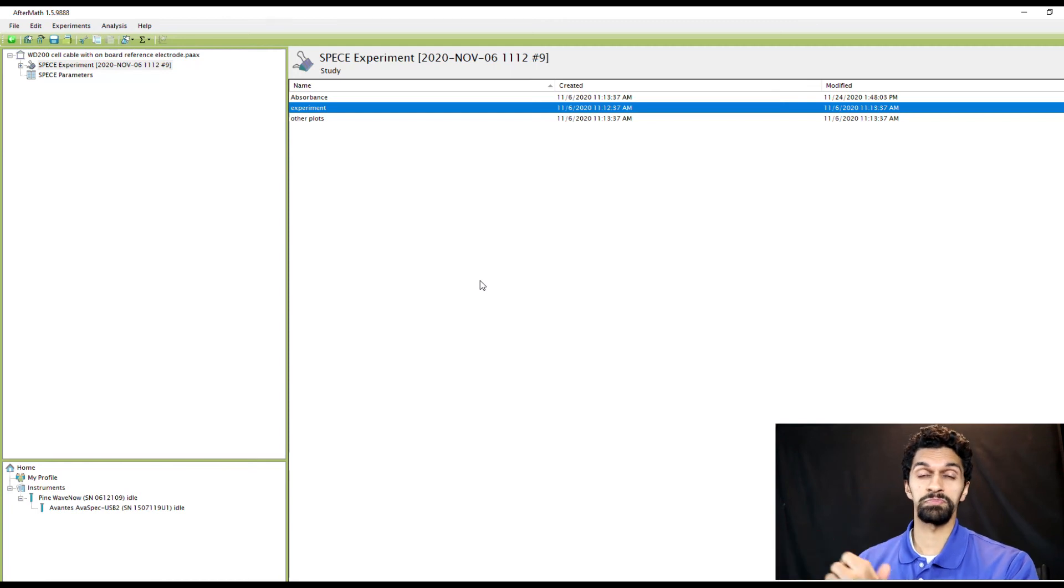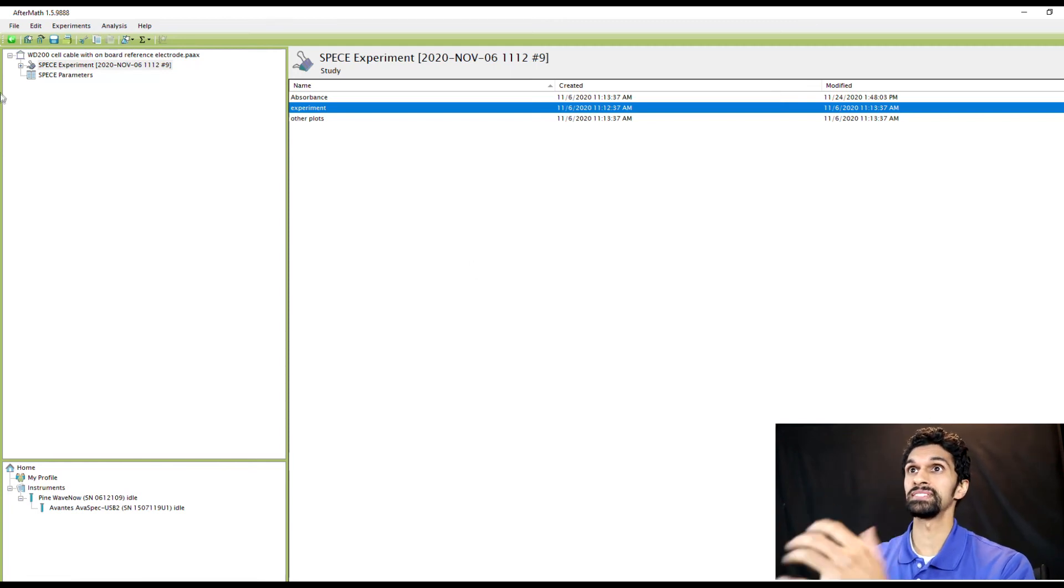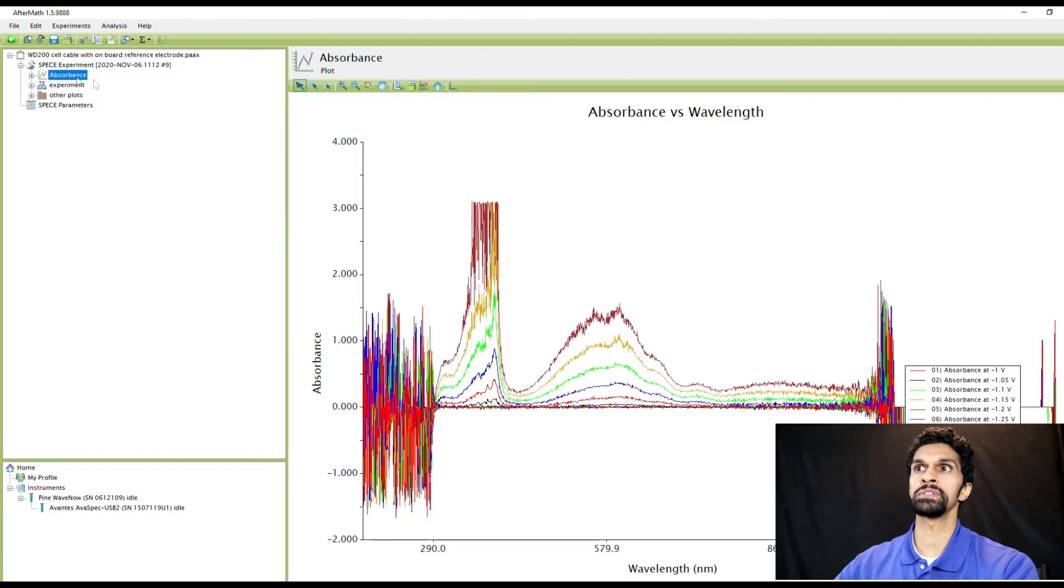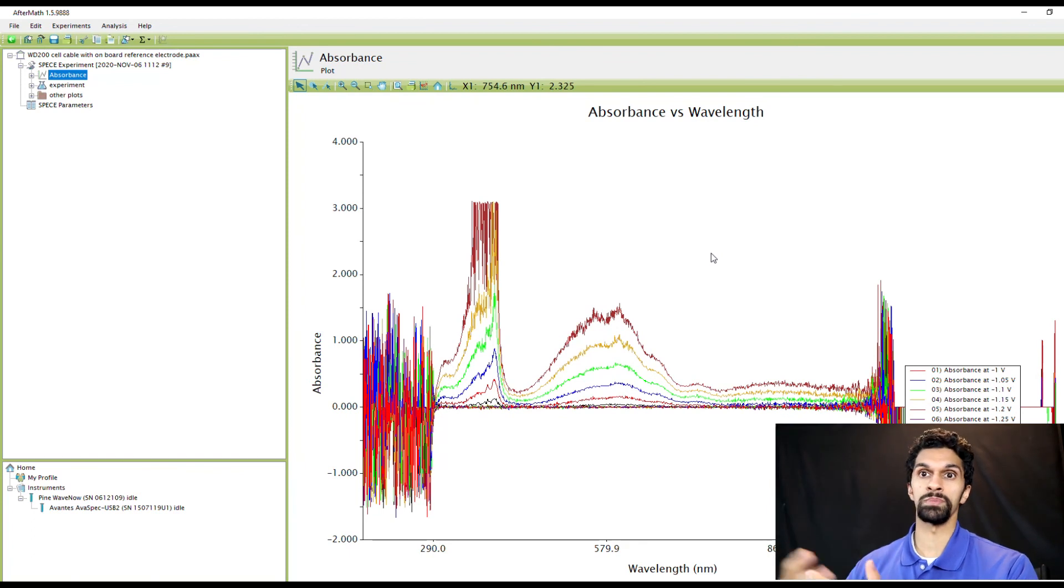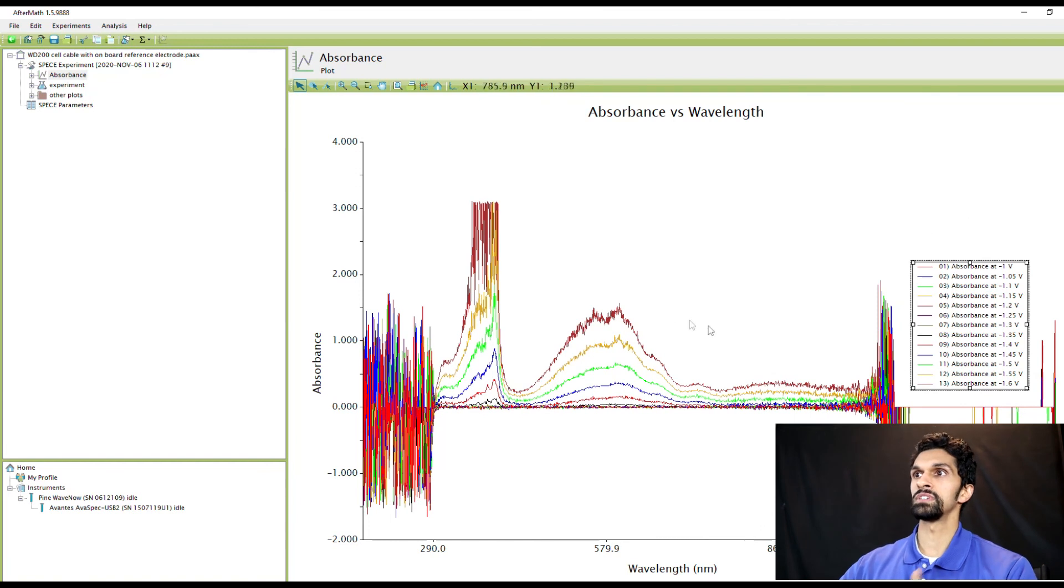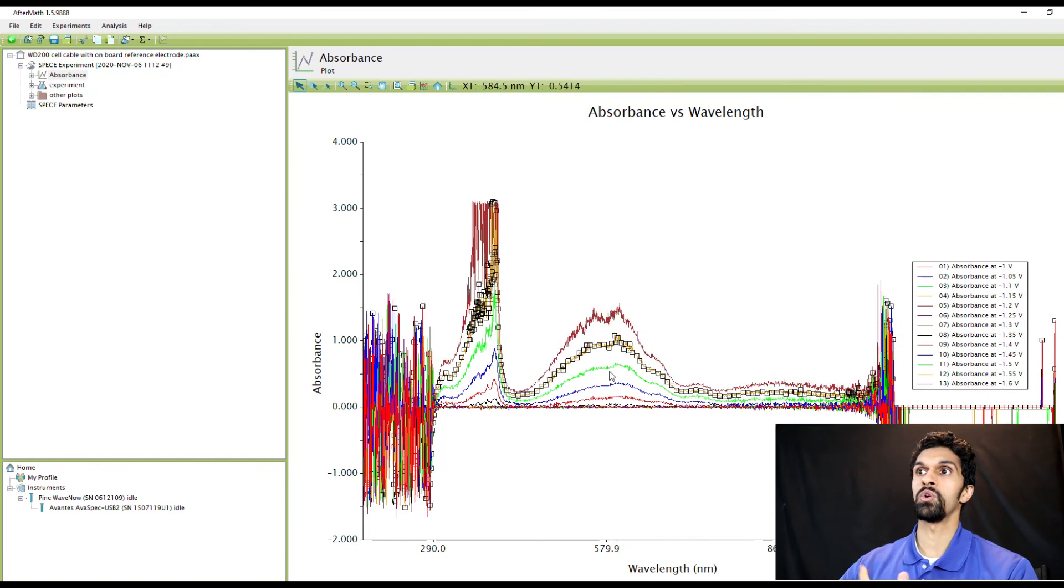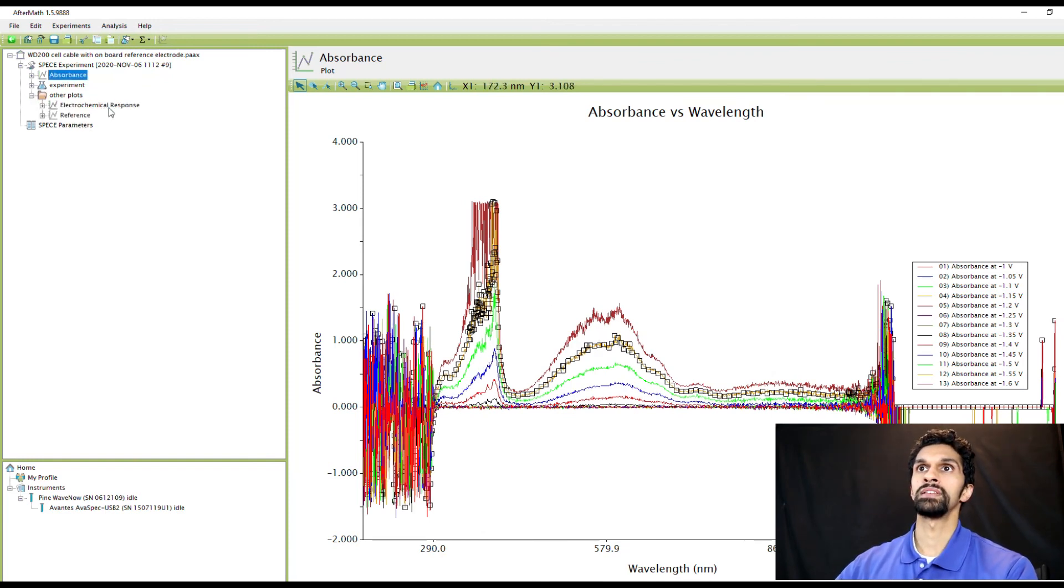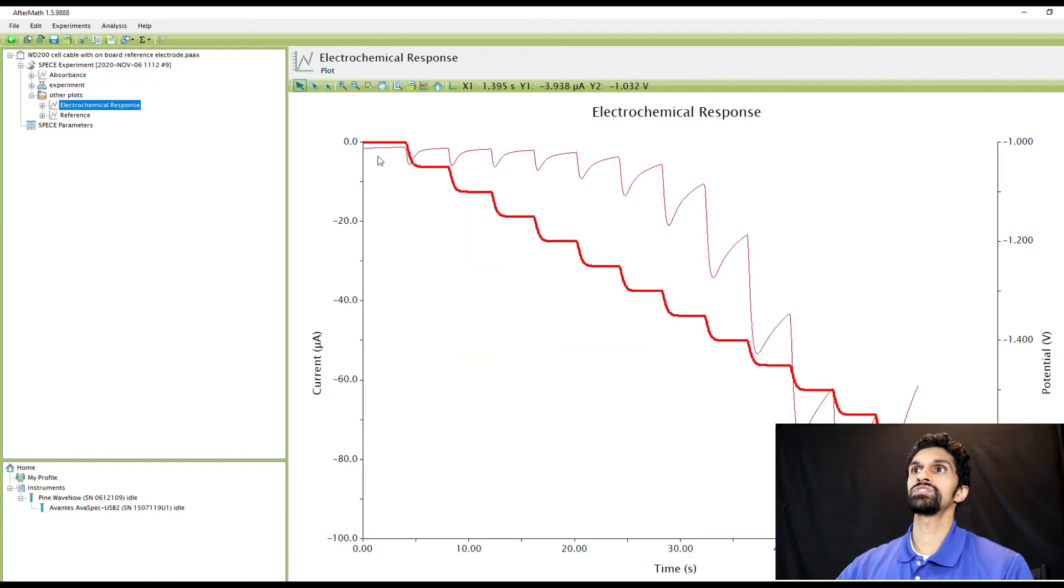After our spectroelectrochemistry experiment is complete, we can find the data in the experiment node. If we expand it and then click on Absorbance you will now see all of the absorption data. On the right hand side you'll see this legend that shows you the absorption spectrum with the corresponding voltage. If you want to look at the electrochemical data you need to go to Other Plots and then click on Electrochemical Response. This shows you the step potential that was applied and the corresponding current response.